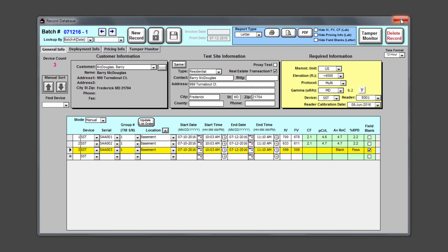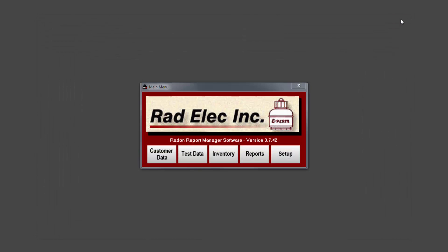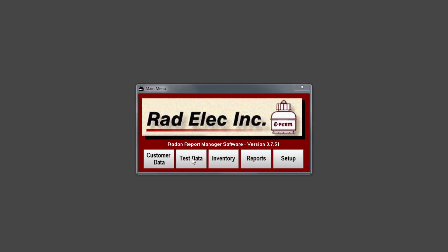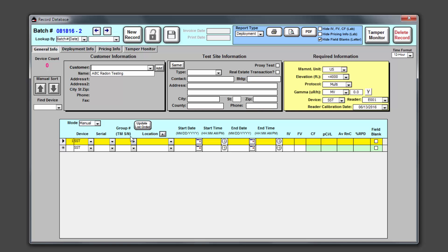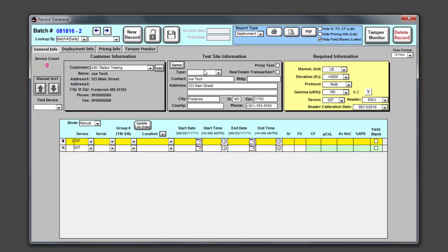Adding a field blank to a test record is as simple as adding a new detector and clicking on the field blank checkbox at the far right end of the row. Sometimes, though, you may want to create a specialized blank record. This is best used for office blanks, which are blanks that are deployed within your own laboratory or office. This specialized protocol will provide more detailed information that specifically concerns blanks. We create a new record and use our own company as the customer, copy that information over to the test site, and set the test type to QAQC. Then in the required information box, let's select field blank as the protocol from the drop-down list.